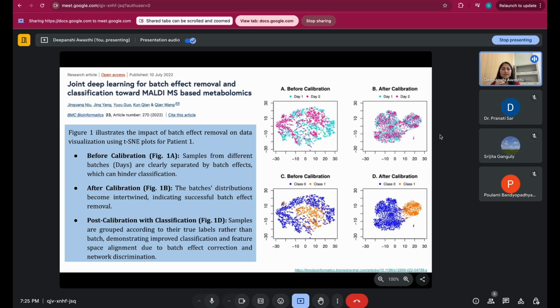So now the spread is normalized, so we will be able to capture them in a better way. We have removed the batch effects which could arise due to the days on which experiments were performed. So this shows that our batch correction method is accurate, because it is trying to bring both of them to a single position, merging them with one another.